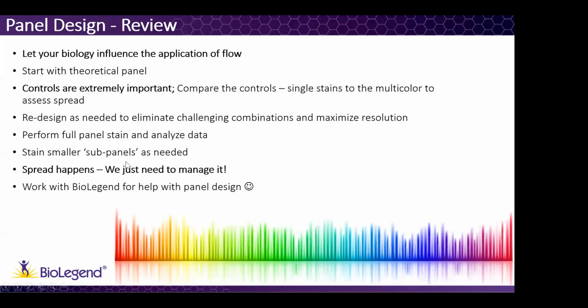And then after you have checked your panel, don't be afraid to redesign if needed. Try to avoid challenging combinations and try to maximize the resolution. And then you always need to perform the stain, and it's recommended, especially if you have valuable samples. So try to do some kind of test run first with something that is not that valuable, so you can be sure that your panel is working.